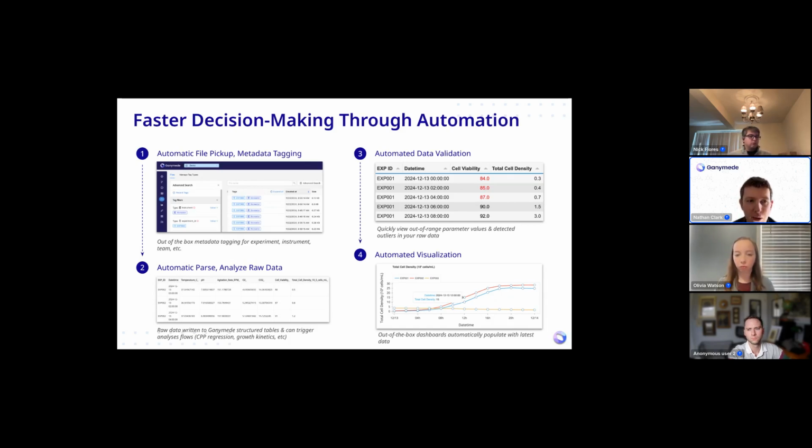because if you say, I have this particular type of cell culture that's different and I need to change the models that are available, or I need some new chart, that's the modular part of modular analysis, is that everything that you see is defined in pretty straightforward low code in the Ganymede lab as code system. And so you can go in and switch out these components at a component level and change that app experience almost overnight. So it's a very effective way to make these apps and analyses work for your science, which changes naturally.